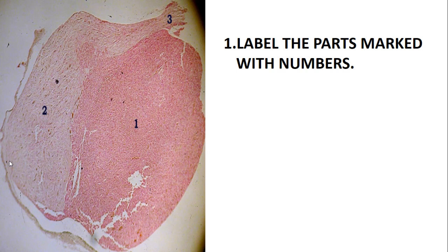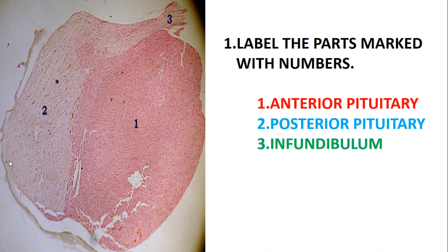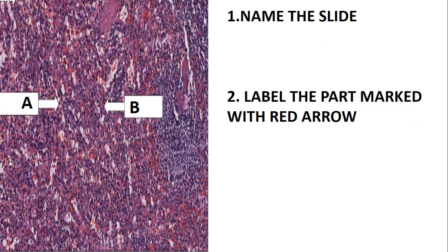This slide is still the pituitary gland. We have the anterior pituitary gland, the posterior pituitary gland, and here we have also shown the infundibulum. Number 1 is the anterior pituitary gland, number 2 is the posterior pituitary gland, and number 3 is the infundibulum. Note that the pars intermedia was already labeled in the previous slide in this tutorial.